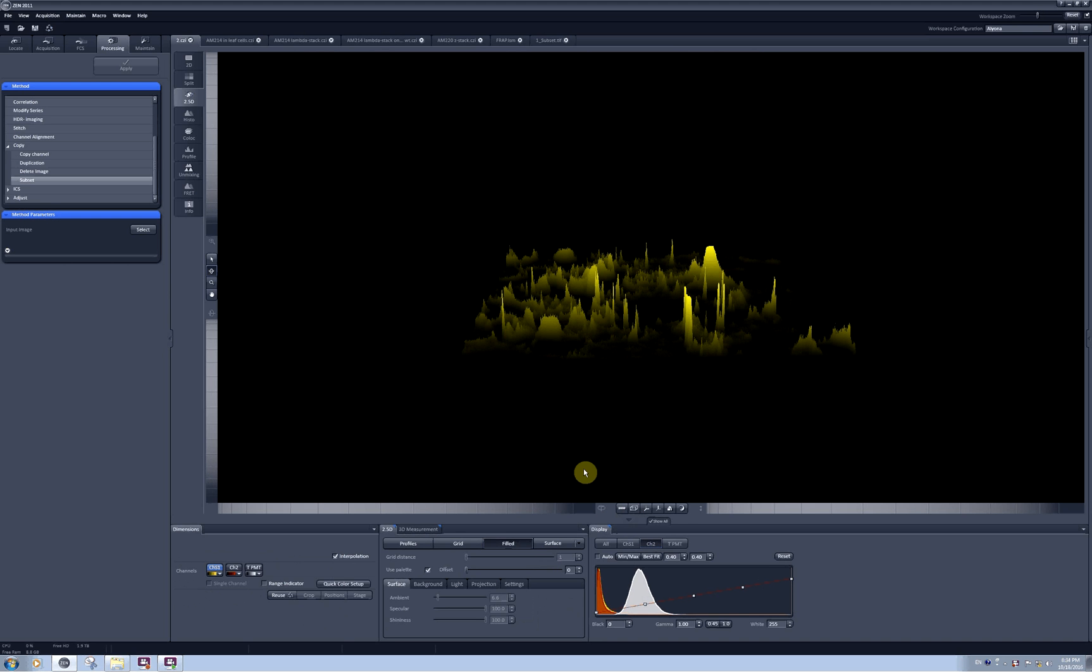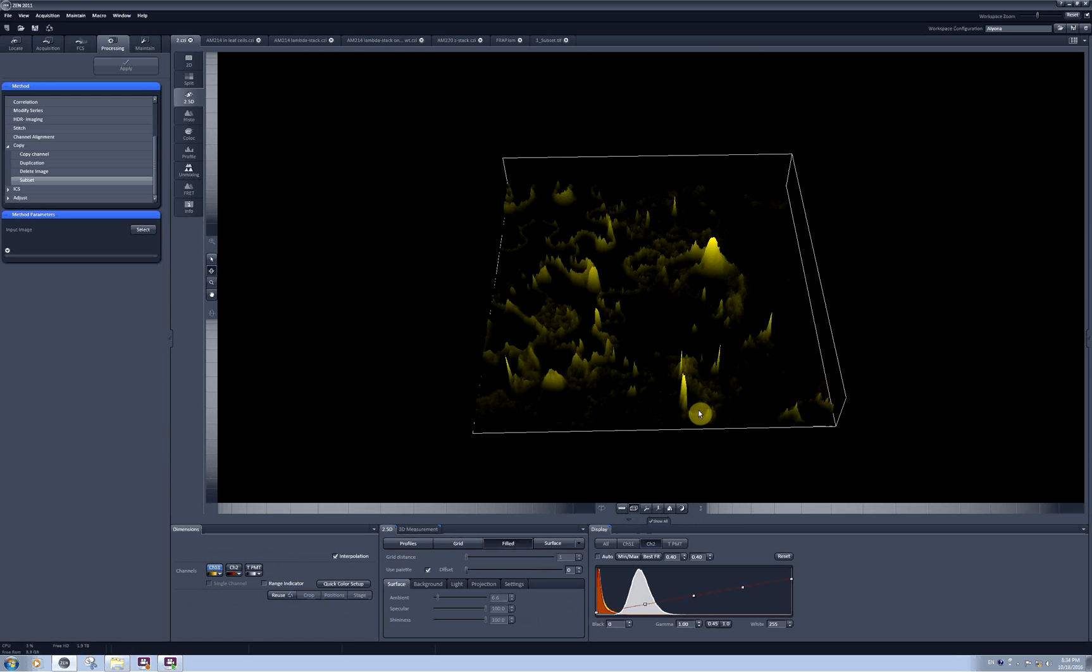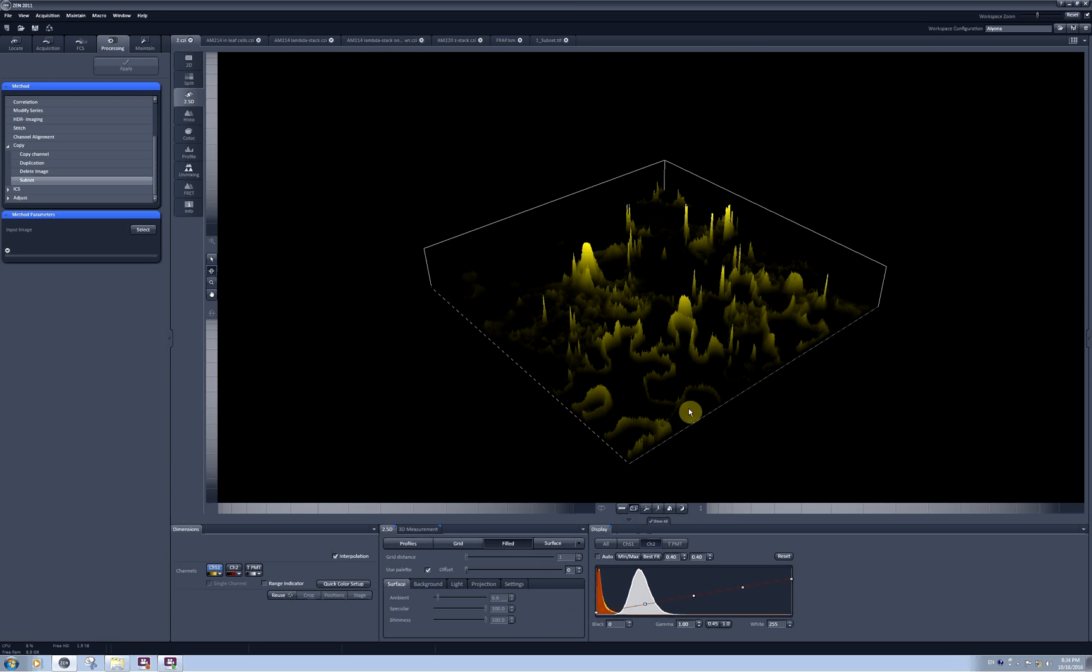This part of the software is very similar for 3D reconstruction and for 2.5D reconstruction. You will get a set of tools here. You can, for example, draw a bounding box around your three-dimensional reconstruction to show where the limits are.